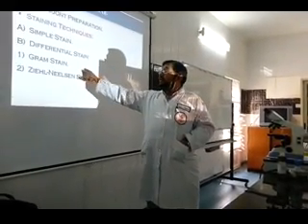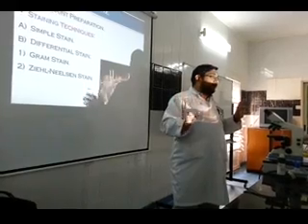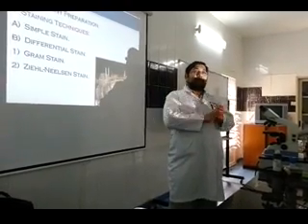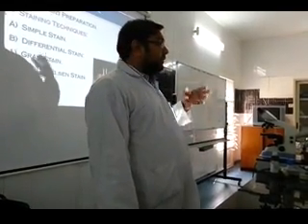So we have gram staining. This is very important, gram stain. Why? It divides the bacteria into two types, gram positive and gram negative. And then we classify again, gram positive cocci, bacilli, etc. Different types of bacteria. For example, if we know which type of bacteria, we can find different antibiotics which will kill that bacteria, and we can help the clinician.